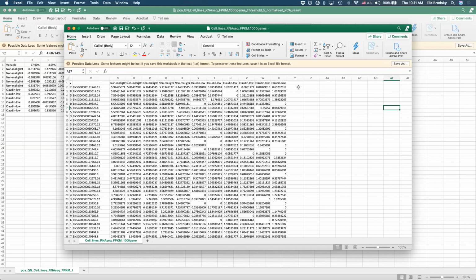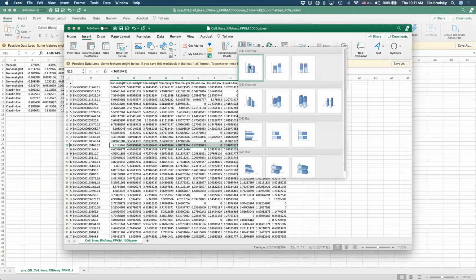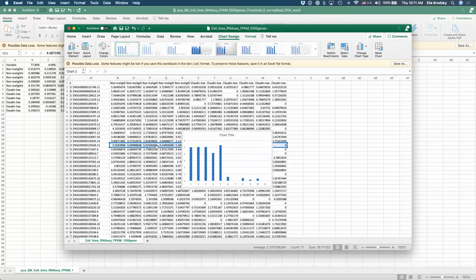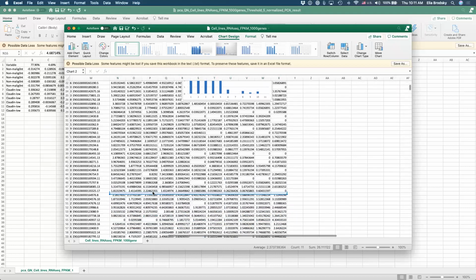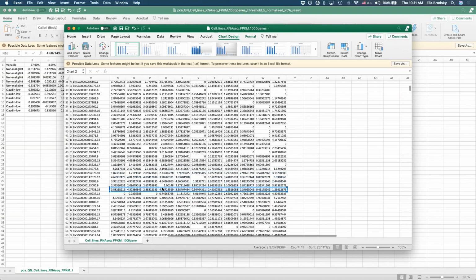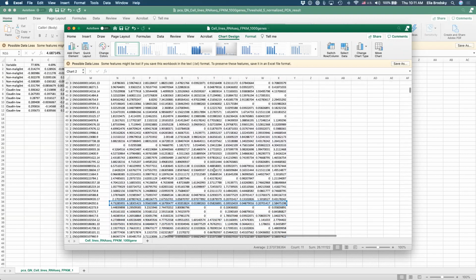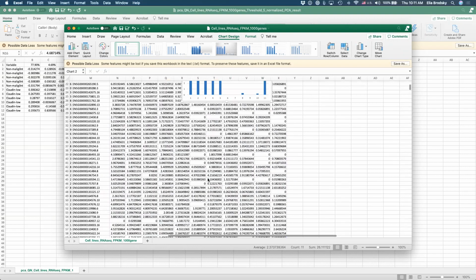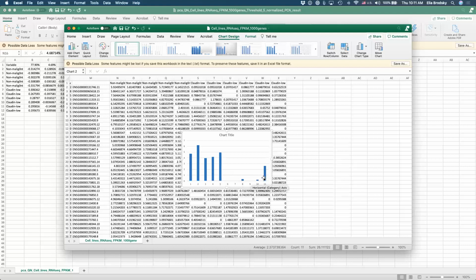What that tells us is that if I have a sample that is not very clear cut, for example, let's say a sample like this, where overall the genes are upregulated, but here I have some examples that are also upregulated.